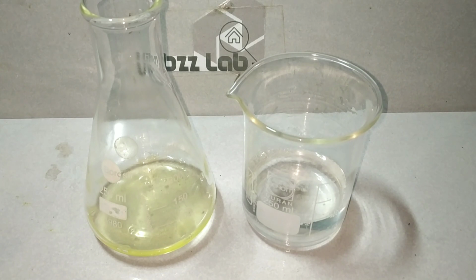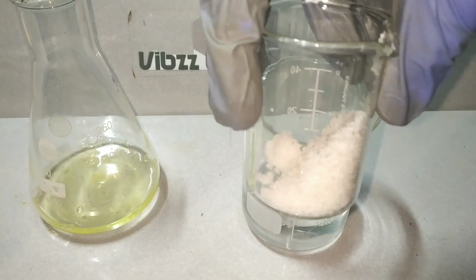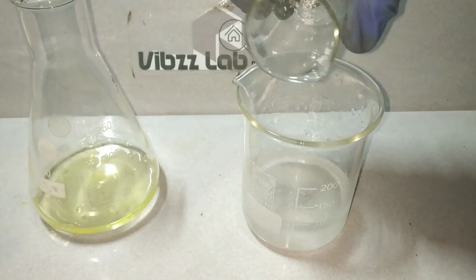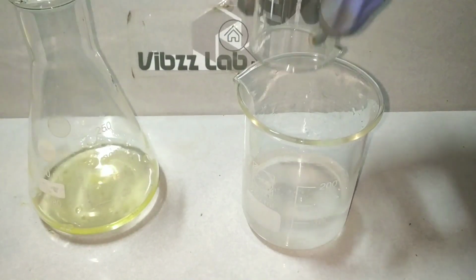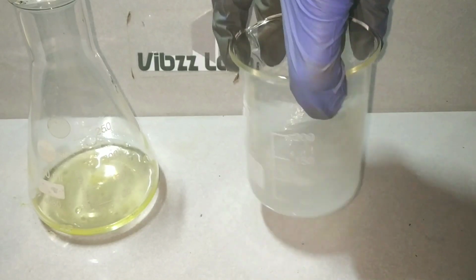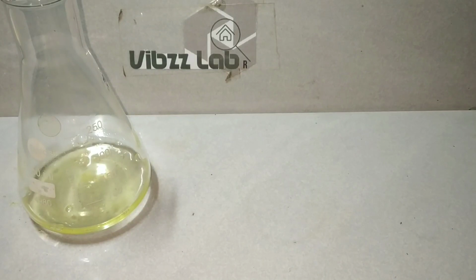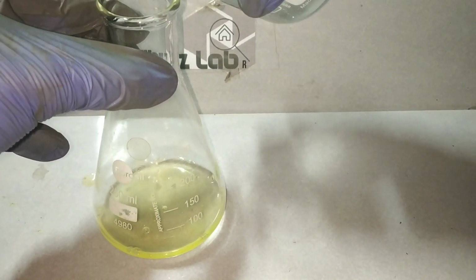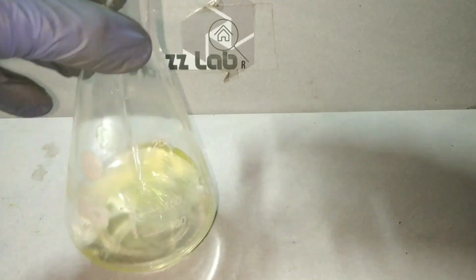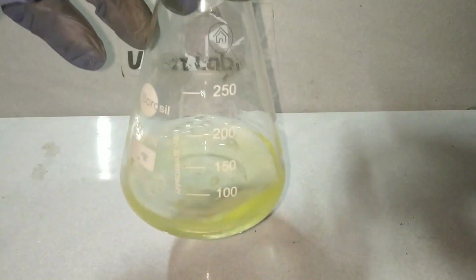Now let us prepare the egg albumin sol. I have separated out the white of the egg in an Erlenmeyer flask here. Now I make 5% weight by volume sodium chloride solution by adding 5 grams of sodium chloride into 100 milliliters of distilled water in the beaker. Electrolytes help to stabilize the sol, but avoid adding too much electrolyte as it can coagulate the proteins. Also, don't warm the water as it can cause coagulation. Now we add this electrolyte solution into the egg albumin with stirring.